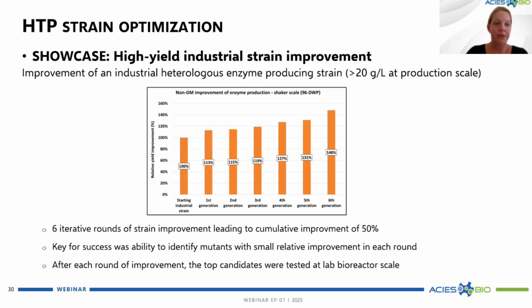So we have several of these systems available, which means they allow us parallel execution and they support OD-based and time-based subcultivations. So these traits that we are changing can be growth rates, substrate utilization, product inhibition, metabolic inhibitors, maybe changing the temperature that the strain grows in, or even plasmid removal, or sometimes we use our ALE system also for testing of strain stability.